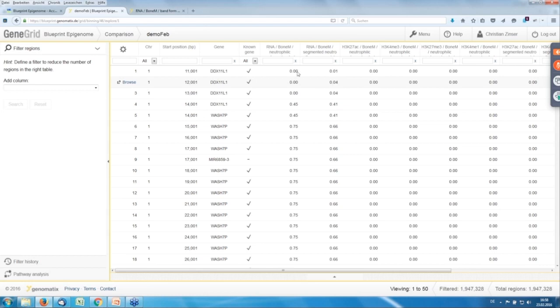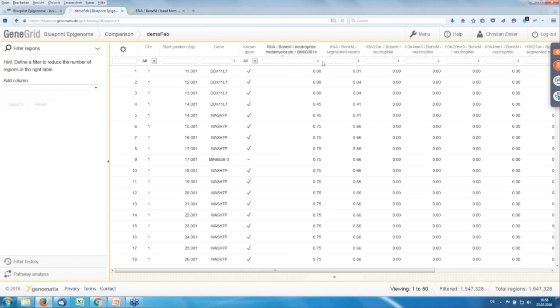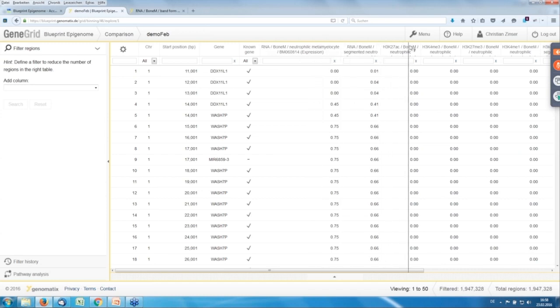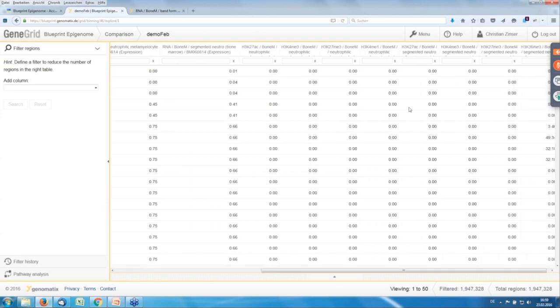Now what do we get here? In this view we get a list with the regions — the bins, here in 1000 base pairs — the corresponding gene, and the values for the different datasets. First the neutrophilic metamyelocyte: we have expression data, the H3K27 acetylation, H3K27me3, H3K4me1, and H3K4me3. The same marks are listed for the segmented neutrophil.